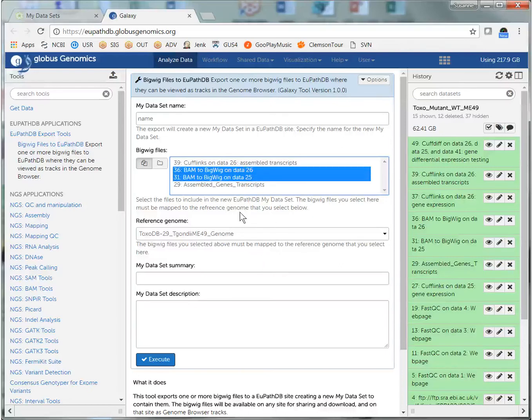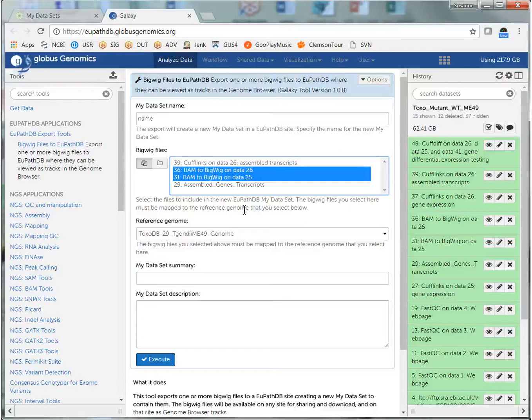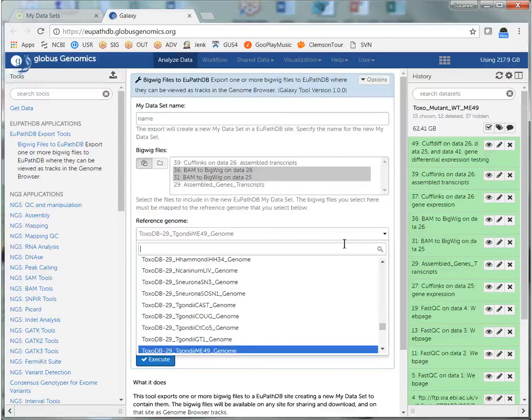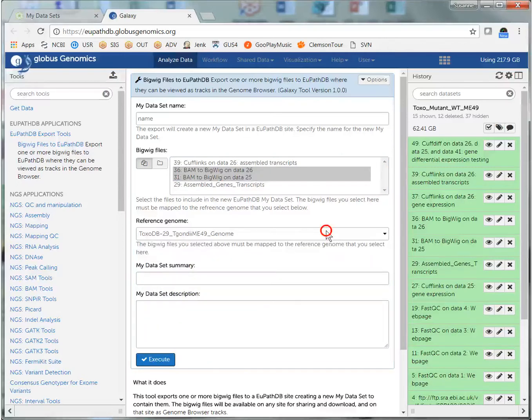And this is important. The files that I transferred need to be tagged with the same genome, and it needs to be the genome that they are aligned to. If you did not do this when you were setting up your Galaxy workflow, you can do it here with this drop-down menu. I've already done it in my workflow, so I'm just going to leave this as TGME49.